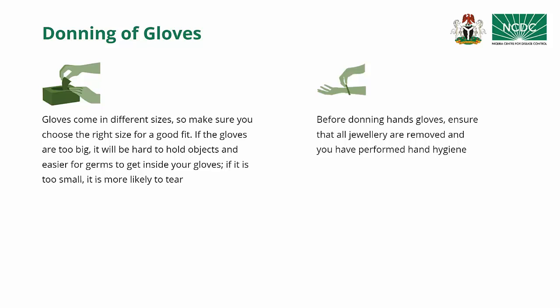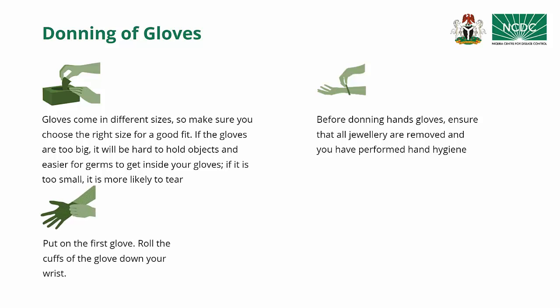Now, before donning hand gloves, ensure that all jewelry is removed and you have performed hand hygiene. Put on the first glove and roll the cuffs of the glove down your wrists. Then, put on the second glove using the same technique.